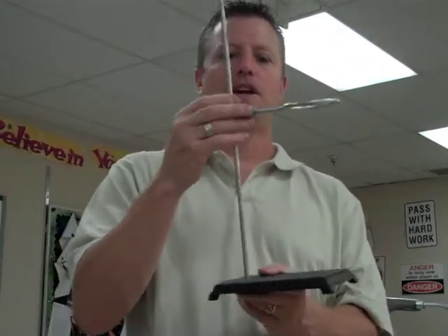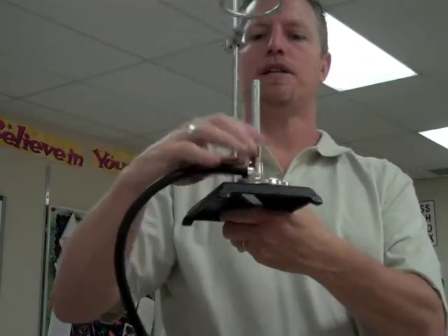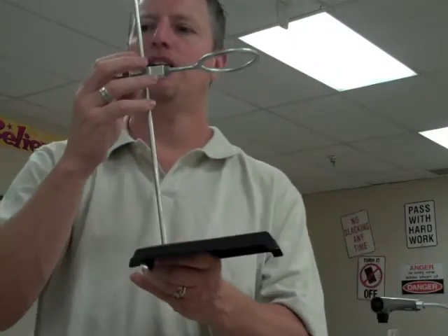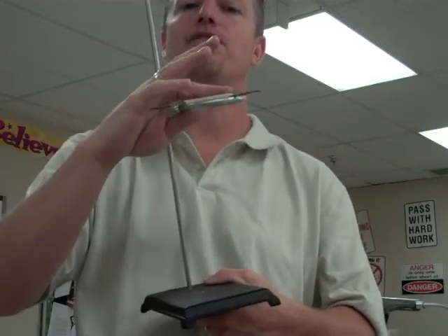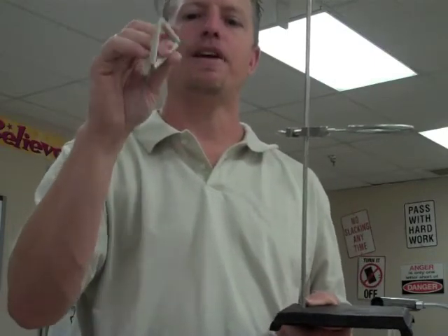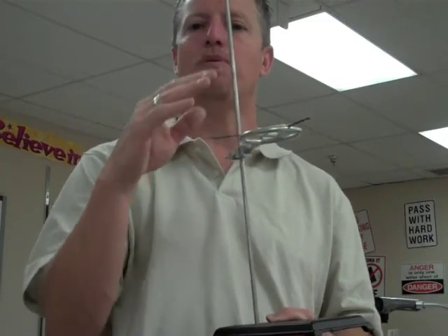This is a ring stand, used in chemistry quite often, especially in high school. The Bunsen burner would go right here at the base, and you'd have things sitting up on the ring or clamped to it, like test tubes. The ring stand needs something like this for beakers and flasks to sit on — this is called a ceramic triangle. The ceramic can handle lots of heat and allows heat to flow evenly when it gets hot. Sometimes we'll also use a wire gauze or wire mesh that sits up on top.